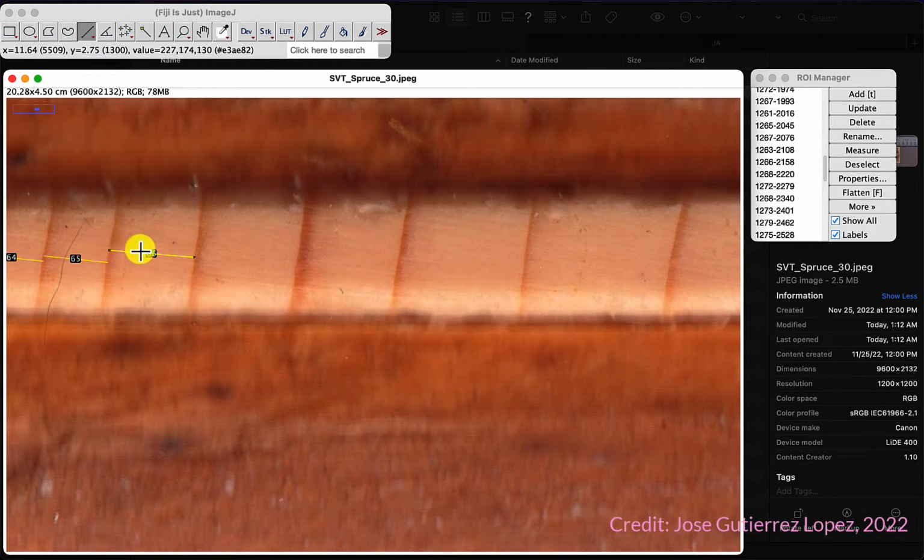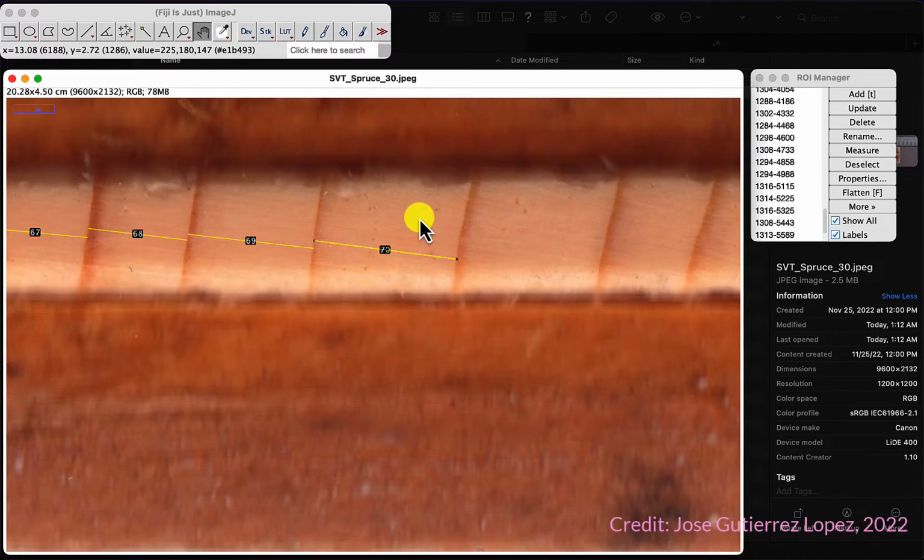If we find a shortcut to shift between, oops, that's crooked. To move between tools like the line selection and this little, what is it called? Scrolling tool. Then, yeah, you might have to use them. I have not bothered looking for them, to be honest, but maybe I should. Now let's go to the scroll tool.